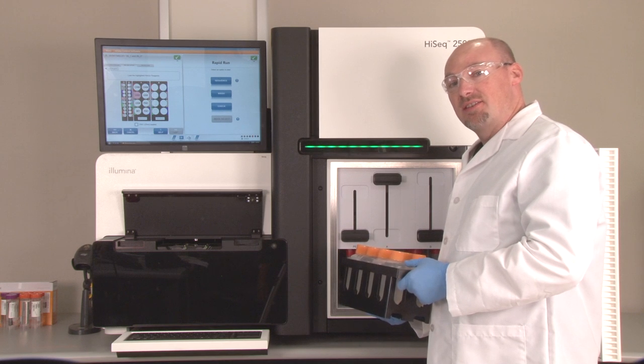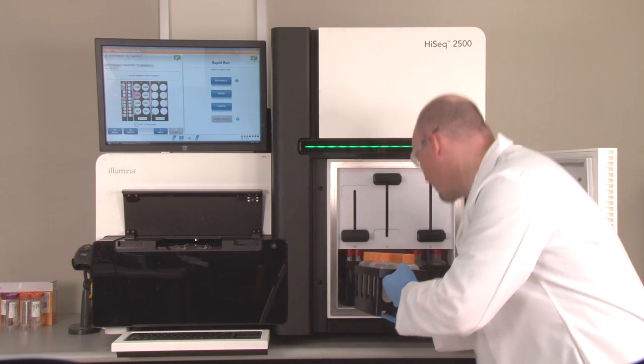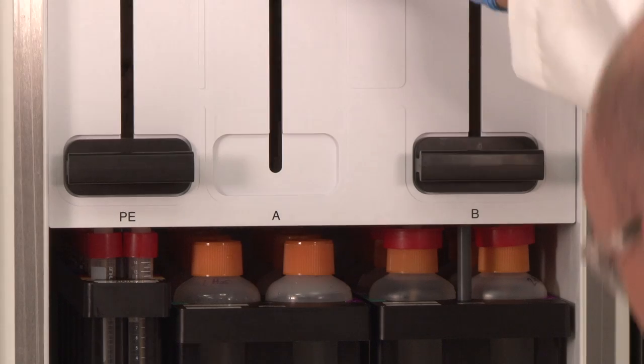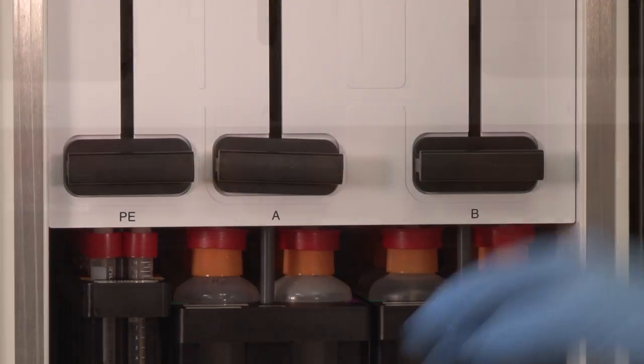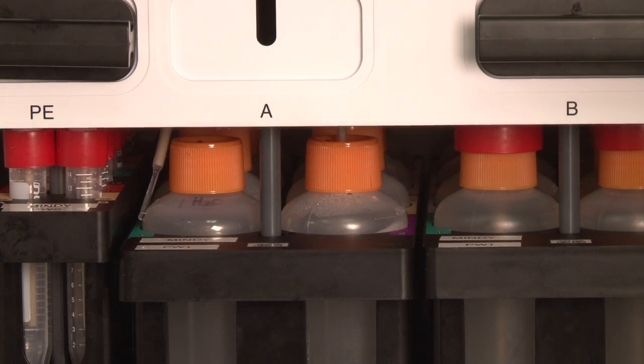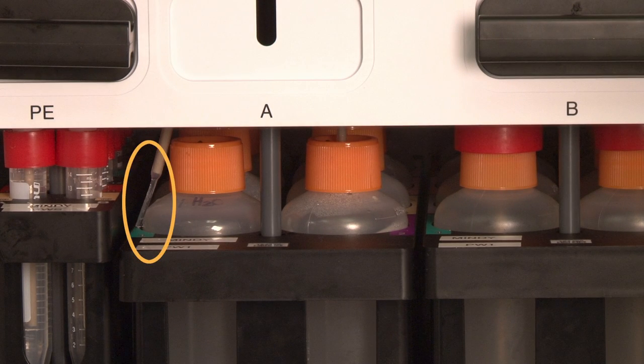When loading reagents into the chiller, make sure to get down to eye level with the reagent rack and monitor the sippers going into the tubes. It is possible for the plastic sipper to get bent and potentially miss the opening of the bottle.